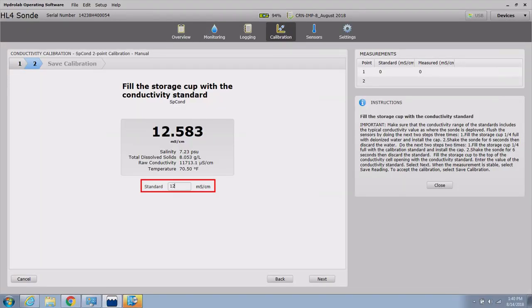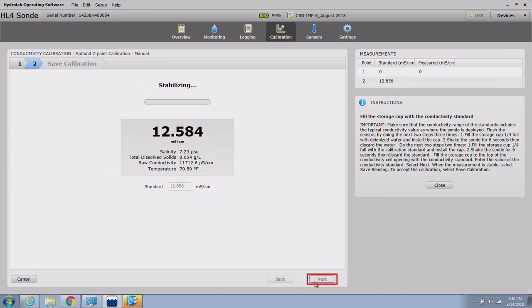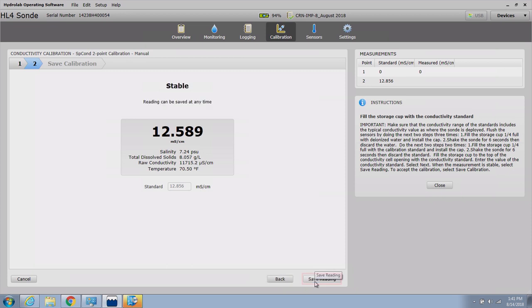Enter the value of the conductivity standard into the standard text box. Click Next to proceed. The stabilization process will begin and must complete successfully before the calibration can be saved.